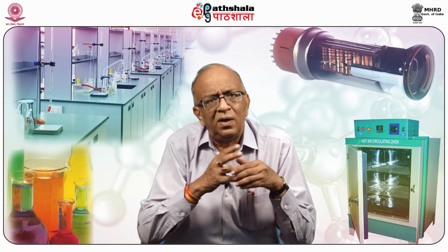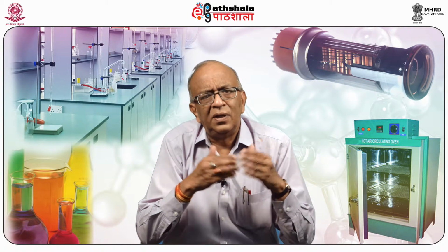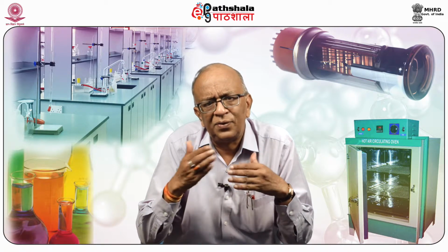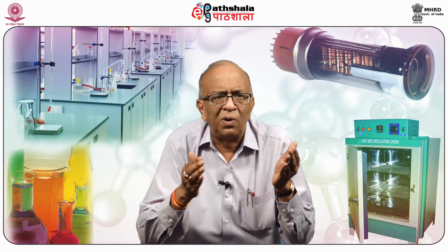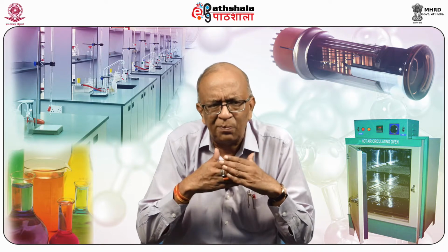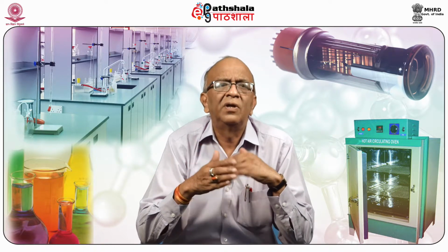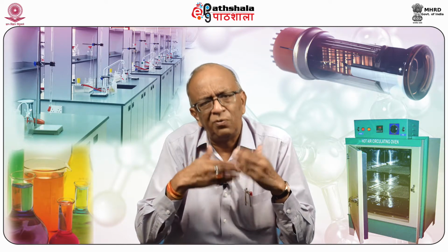Another, third technique is differential thermal analysis, that is the DTA. Here the apparatus used is the differential thermal apparatus, so the complete DTA apparatus will be used, and here it is the plot of delta T versus temperature. This is a very important technique. These techniques are particularly useful in studies of polymers, in polymer chemistry, in coordination compounds, in complex formation. These techniques are very widely used.